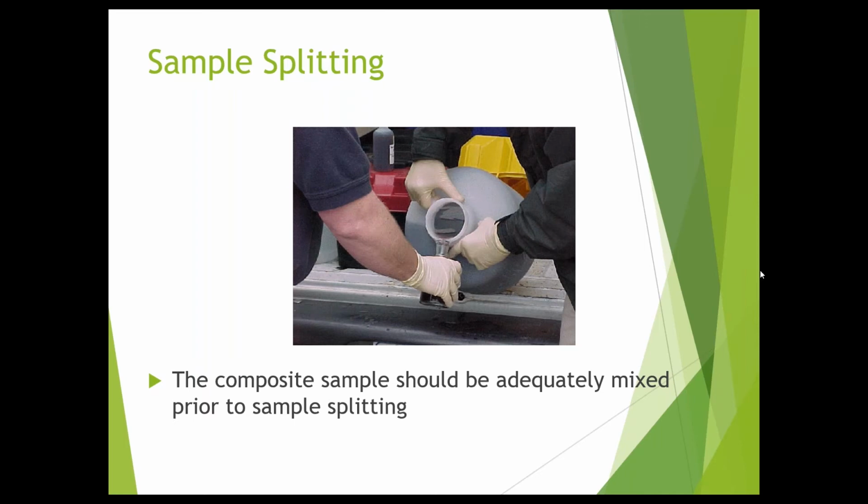As long as you're not doing volatiles, you want to shake that container up really good. Make sure you get it evenly dispersed. That way, when you go to pour it up, you're getting a representative sample. You're not letting all the solids settle to the bottom and decreasing your solid count. Because when your inspector or your regulator comes, they're going to shake it up and they're going to see your sample has more solids, and they're going to ask, well, what's going on here?